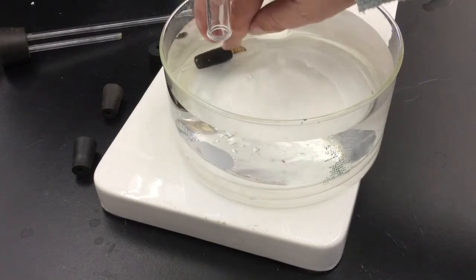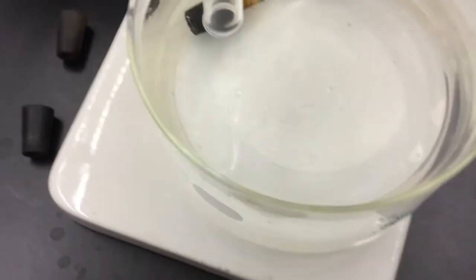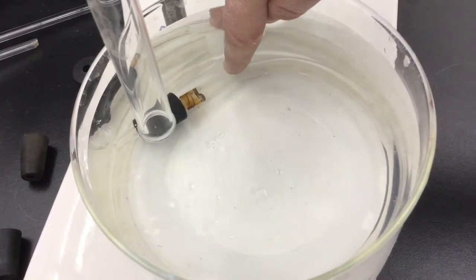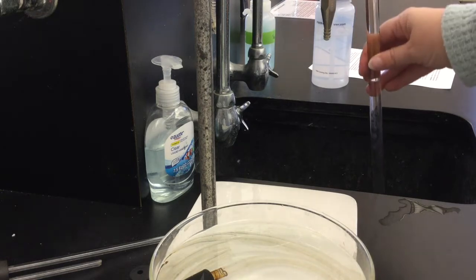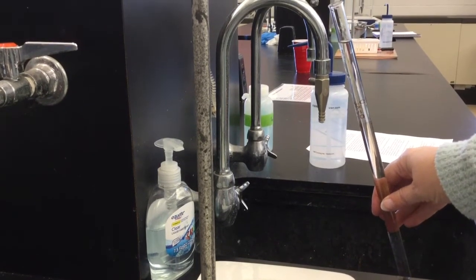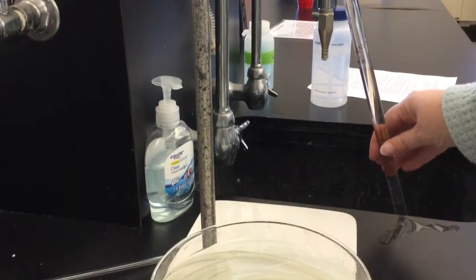You can look at your tubing and check for air bubbles. I have a small air bubble here that, because it's near the end, will go away once I attach my equipment. You will need to fill your eudiometer with water, but make sure that you leave room at the top. You can see I've got maybe 1.5 inches of air at the top. This way you will be able to read the initial reading and know how much of the gas you have collected.